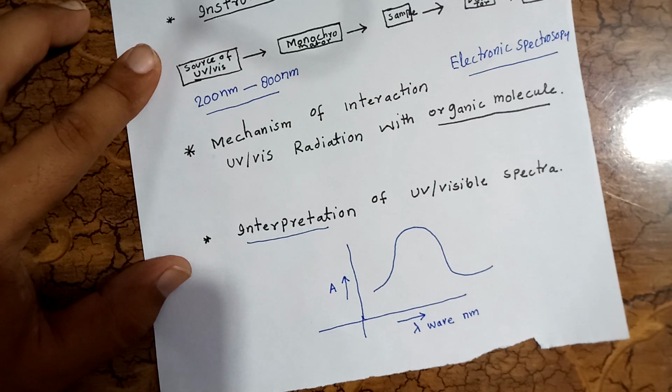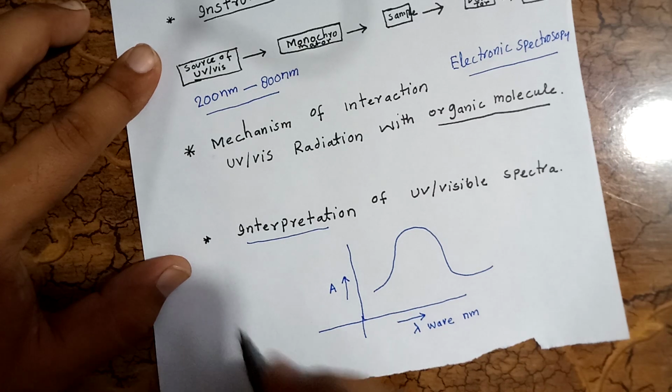Here, take two things into consideration. First, what wavelength of light is absorbed.